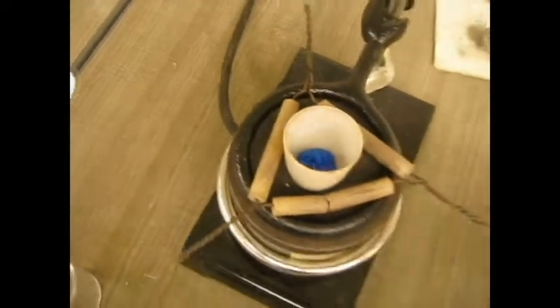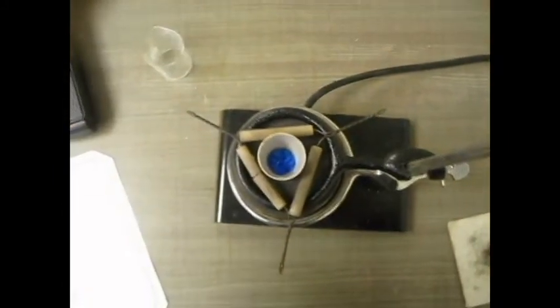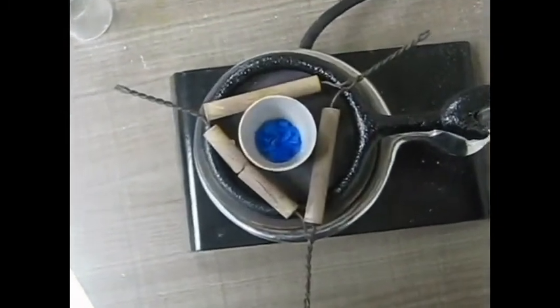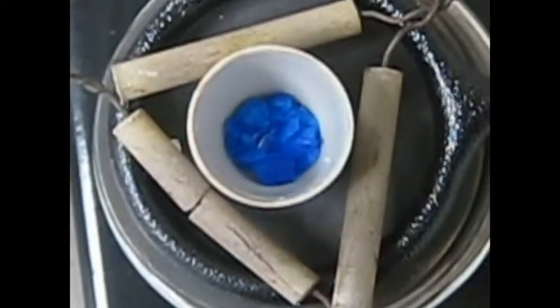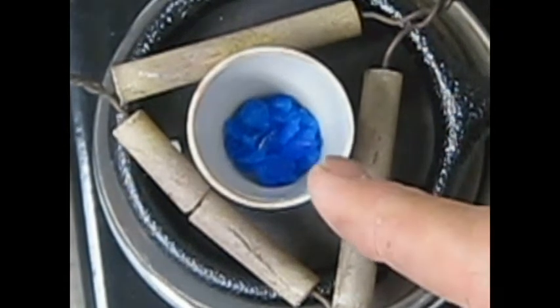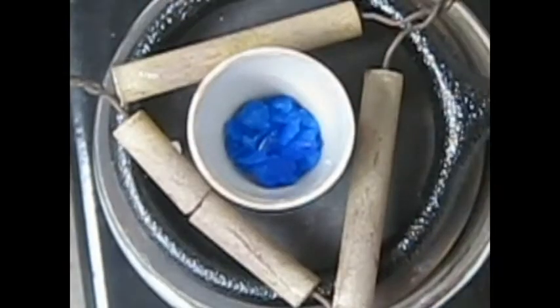Now I'm going to take this, put it onto the hot plate, and we're going to watch the color fade. I'm going to put the camera above and leave it running, and I might fast forward through some of this. When the blue is gone, that means that the water is gone, and then we'll have a dry salt. I'm going to zoom in a little bit. Let's see if I can do this better. There we go. So now watch what happens with this color. It's actually, I feel the heat rising off here. I'm going to be very careful. I'm only going to handle it with tongs when I need to move my crucible.